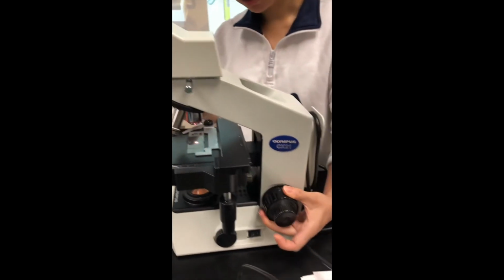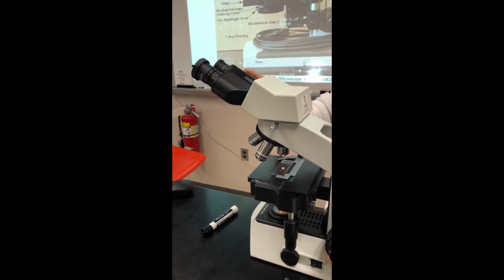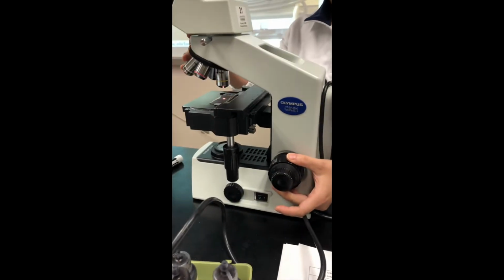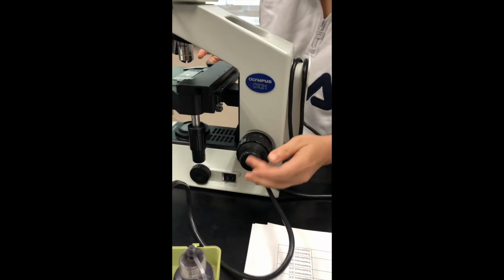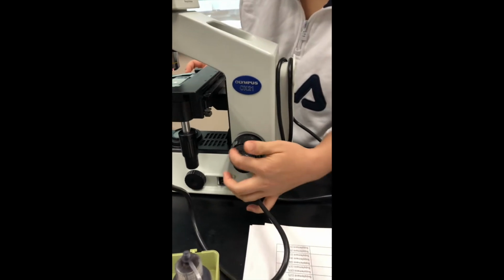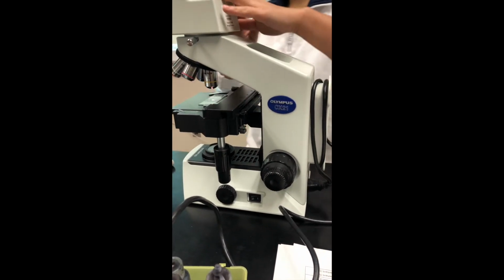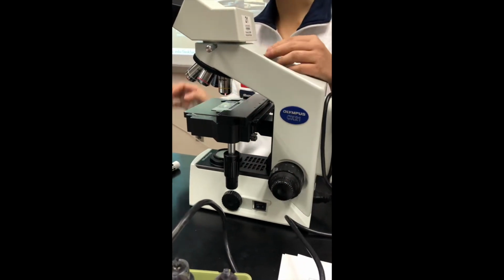Then you could adjust and see through your ocular lens, and when it's in focus, you could change to 10 times. And when you change to 10 times, you are going to use the fine focus. So here is our coarse focus, the big one, and the fine focus would be the smaller ones, your fine focus to adjust the distance between your sample and the objective lens. So this is all the things I want to introduce to you about our compound microscope.